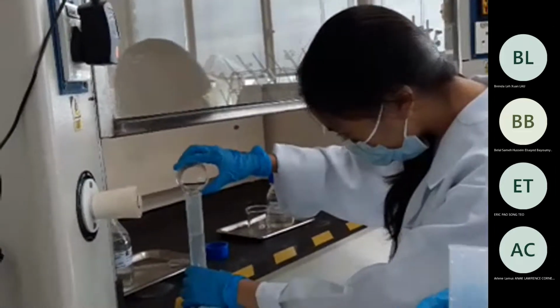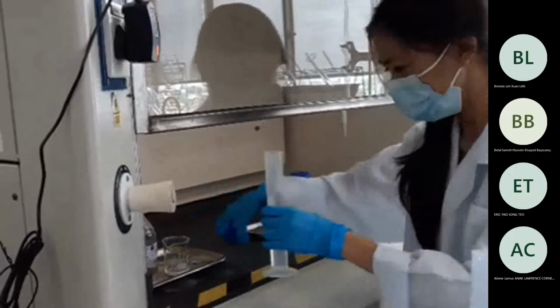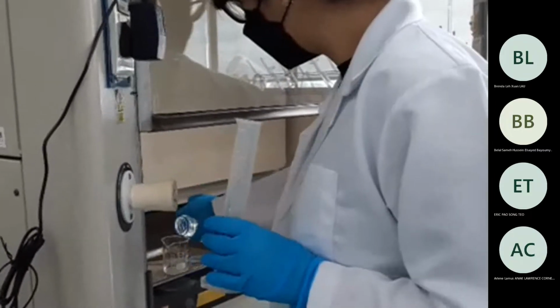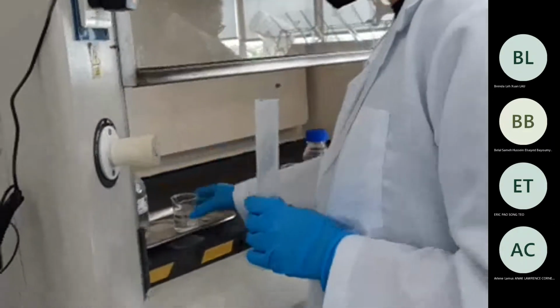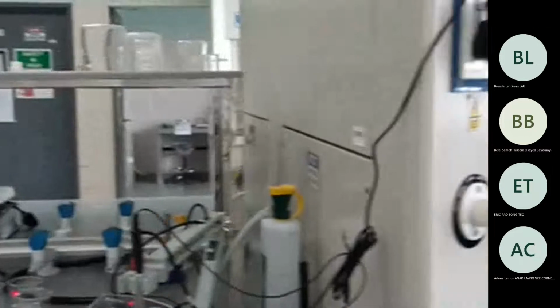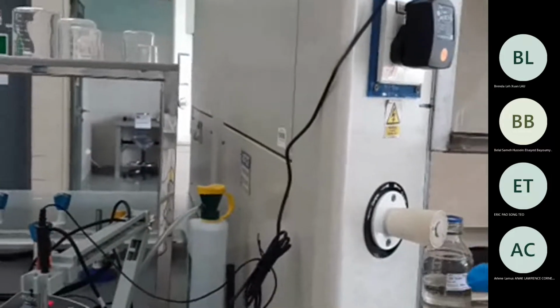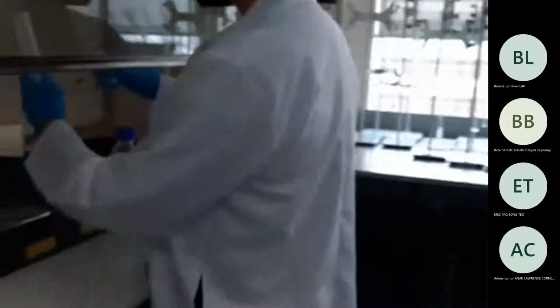Bring your eyes to the level. Yes. 50 milliliters should, yeah. Is it 0.1 molar? Wait, no, it's 1.0, according to the procedure. Really? Oh, both are 1 molar. Yeah, both are 1 molar. Okay.